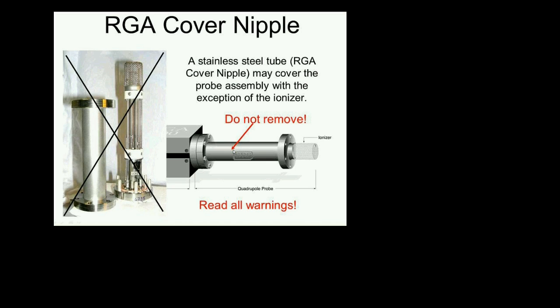Kind of a funny thing is when I was shipping this product, we used to put a little paper around it that said, do not remove these without consulting the factory. And then we would get calls saying, hey, my device doesn't work. And I would ask, how are you operating? Eventually they would say they had removed the tube, and I would say, didn't you see the paper that said do not remove the probe? And they'd say, oh, no, we took it out and threw it away right away. We never read it. So the paper was there for a good reason.